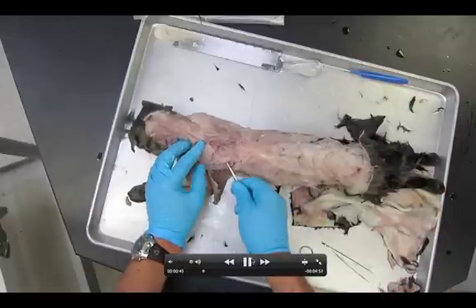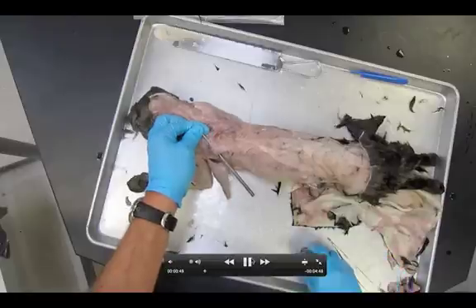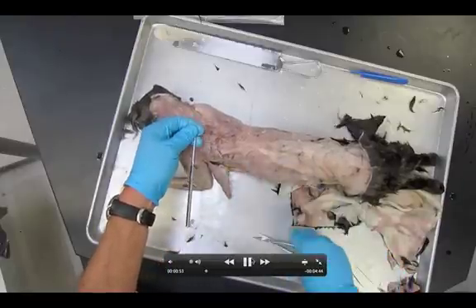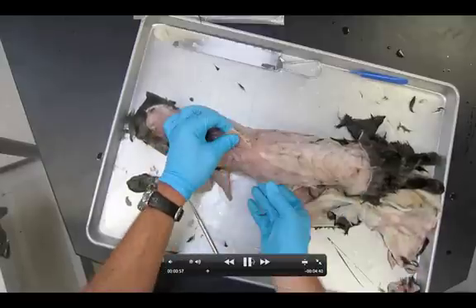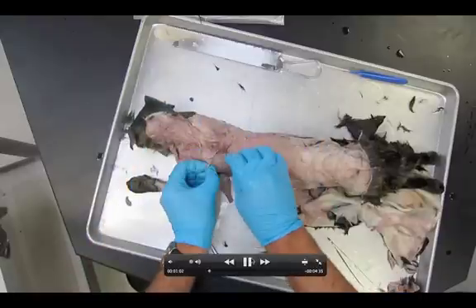Next we're going to take a look at the spinotrapezius and cut it in the same way. Notice I've gotten the probe all the way through it. About the middle of the muscle we're going to chop it — one big slice. We can now lift that one up out of the way. So I've got two muscles completely cut; let's move on, we've got two more to go.